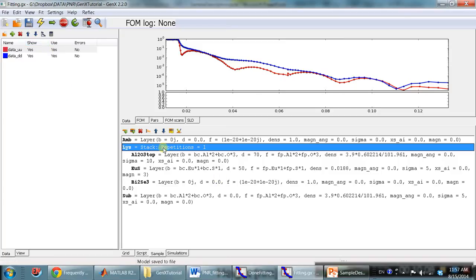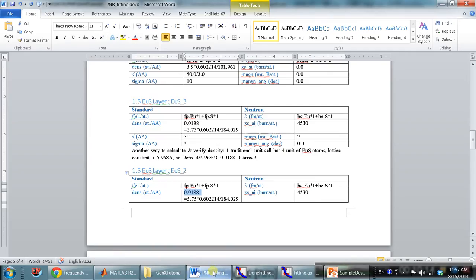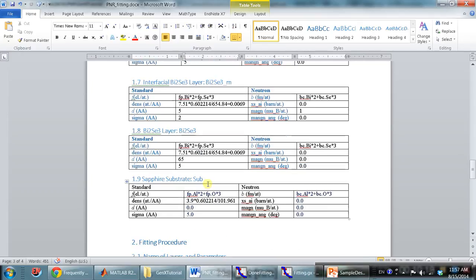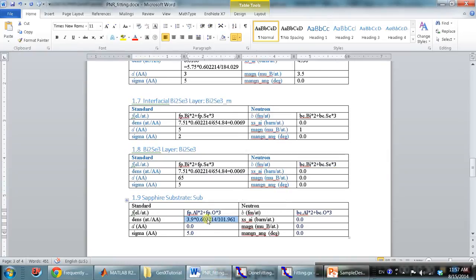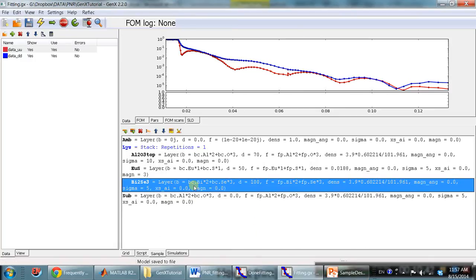Okay. So this layer we also need to build, just for completeness. We build it the same way we build the other layers. And for density, we don't even need to calculate, just write down the equation for how to calculate it. And sigma. Alright, that's it.